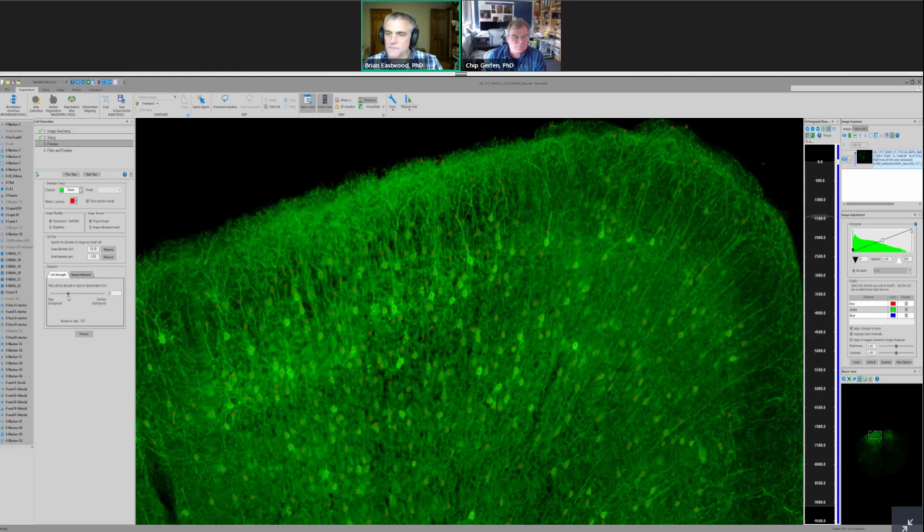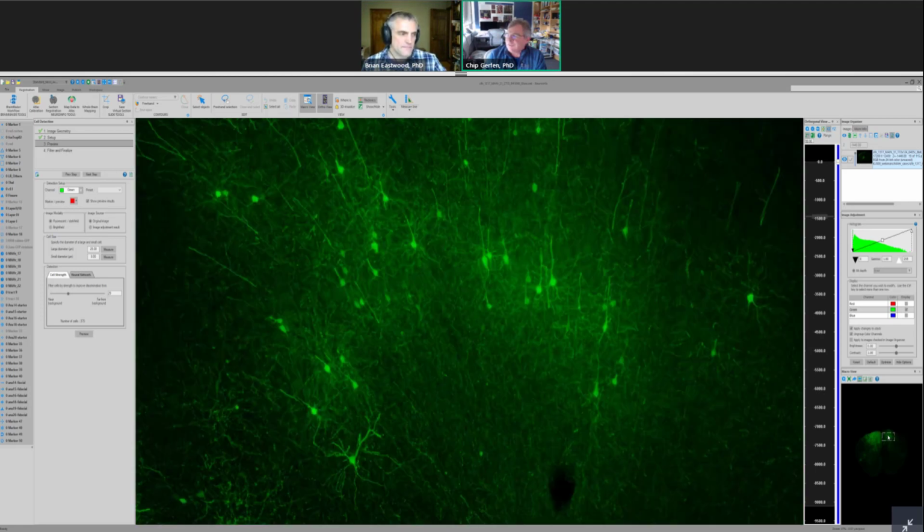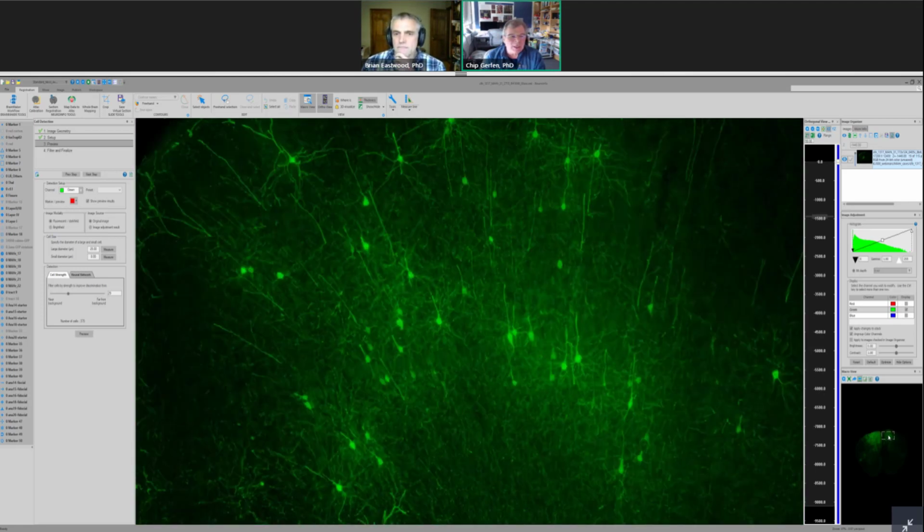that we're not interested in everywhere. So what's been added is now this is where we've done machine learning on the same neuron fields. And so Brian. Yeah. All right. So if you go over to the neural network tab, we've been doing a lot of research with deep neural networks. And what we're doing here is we're using those to refine the results of the cell strength filter. So we're actually still using the same set of parameters.